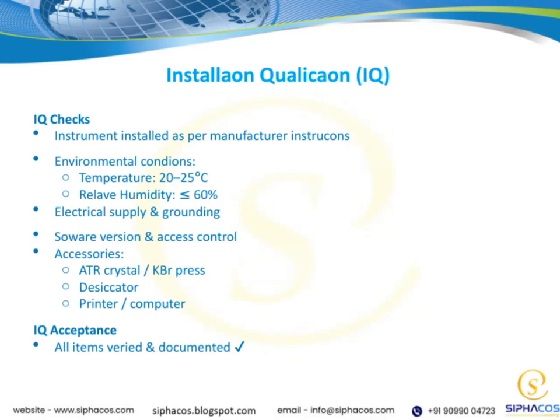Now, let's talk about the installation qualification, or IQ, which is a crucial step in ensuring our equipment is set up correctly. First, we need to verify that the instrument has been installed exactly as the manufacturer instructs. This helps us confirm that all installation steps were followed properly, setting a strong foundation for reliable operation.